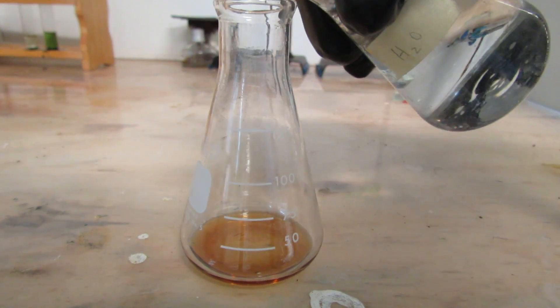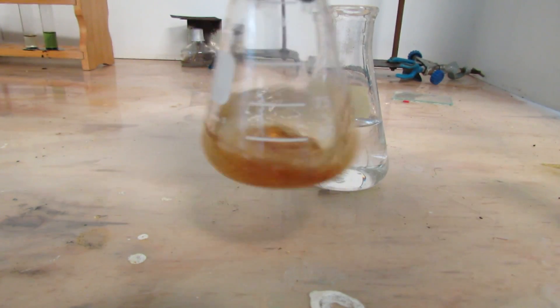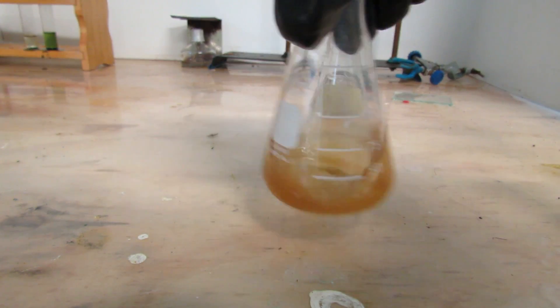First, add about 50 milliliters of distilled water to the 5 milliliters of syrup. Swirl the flask to ensure thorough mixing of the two ingredients.